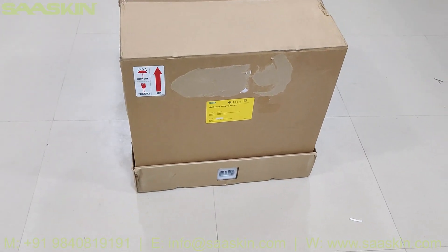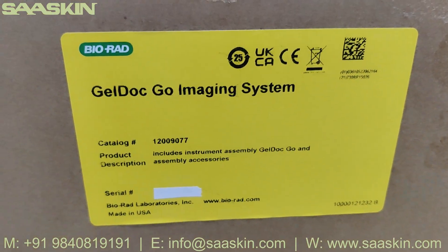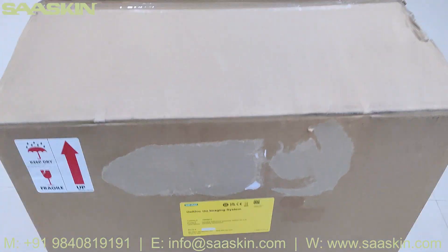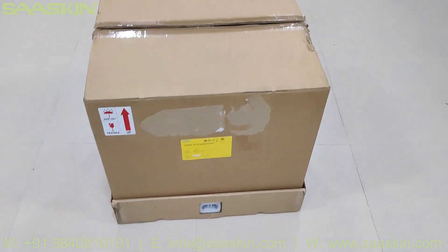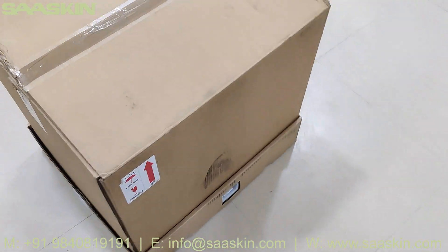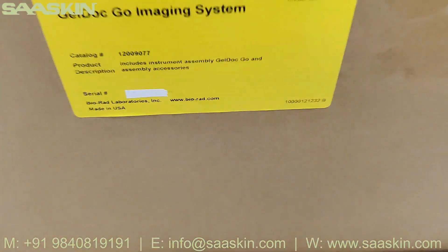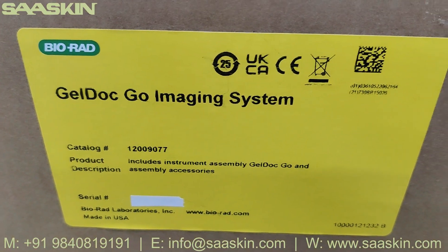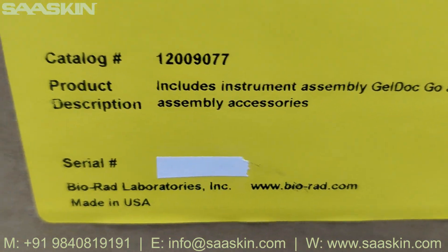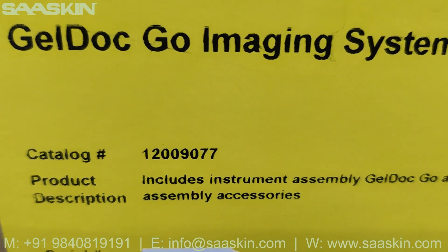Hello everybody, today we are going to see the unboxing of Bio-Rad GelDoc Go Imaging System. You can see the product here. This is the catalog number — it is 12009077. This is how the total box packing looks like. It says Bio-Rad GelDoc Go Imaging System. This is a certified product manufactured in the US by Bio-Rad Laboratories.